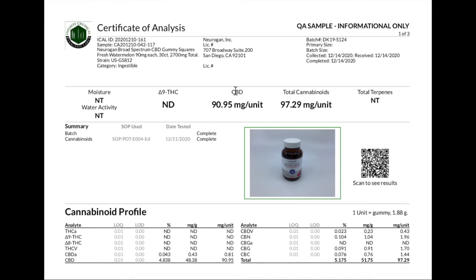Head to the right to view the section titled CBD. This section will let us know how much CBD is in a single gummy square. As this is a lab report for our 90 milligram gummy squares, we can see that the total in the CBD section of 90.95 milligrams of CBD hits it right on the mark. As our products are handcrafted, expect that the milligrams are either higher or a few milligrams lower in this section.